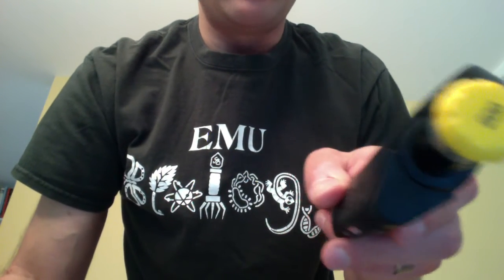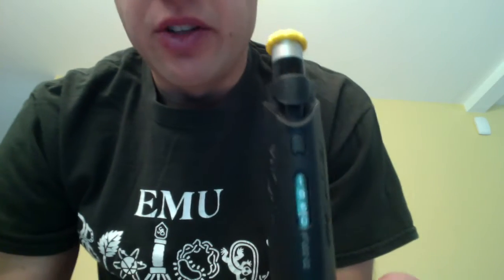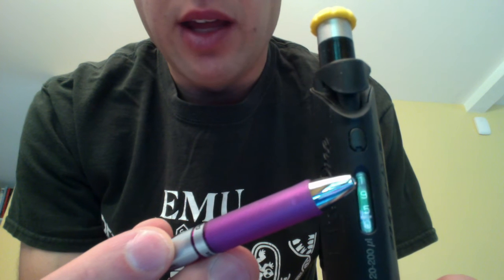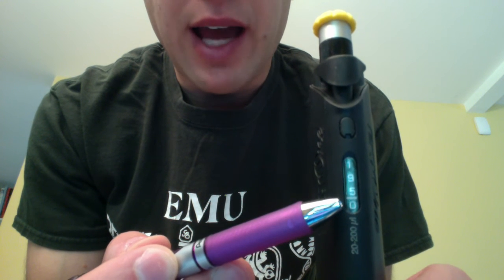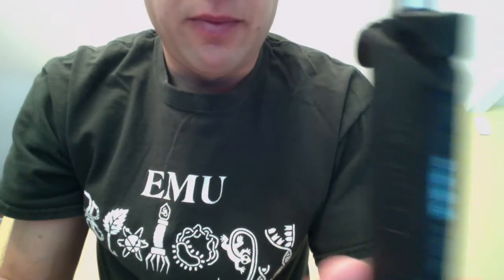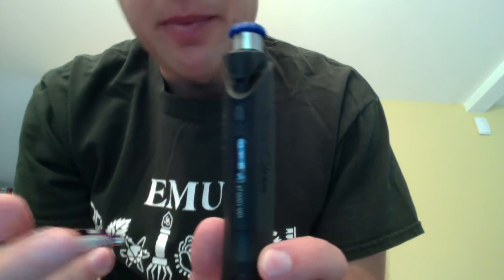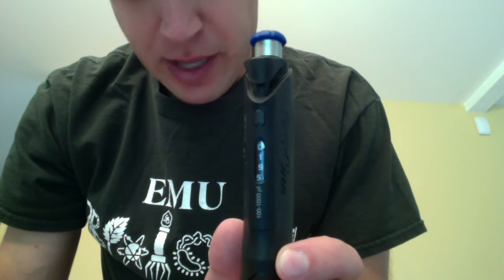This here is the P200, the 200 microliter micropipette. It also uses the same yellow tips as the 20 microliter micropipette. The digits on the display — again there are four: the top one is hundreds, one beneath that is tens, one beneath that is ones, and then beneath the line is tenths. And this here is the 1,000 microliter micropipette. It uses blue micropipette tips — sometimes these are clear as well. It has four digits on its display as well: from the top, thousands, hundreds, tens, and ones. There are no fractional microliters on this micropipette.